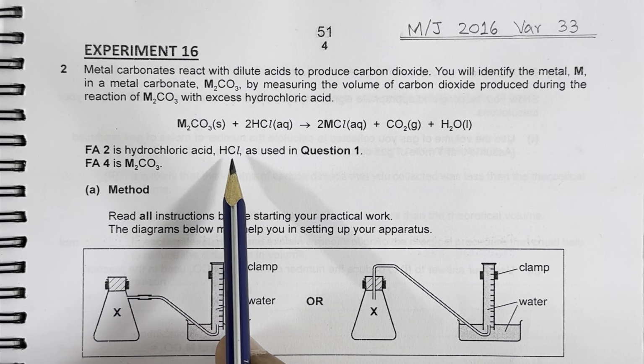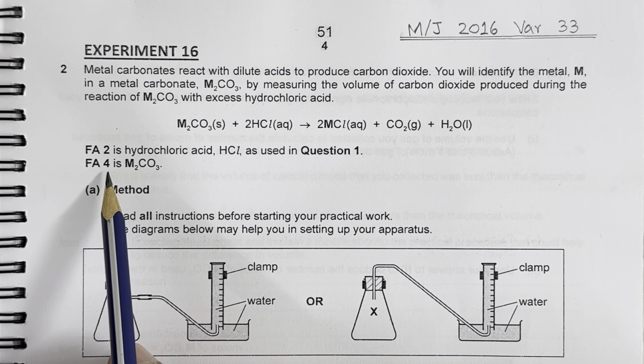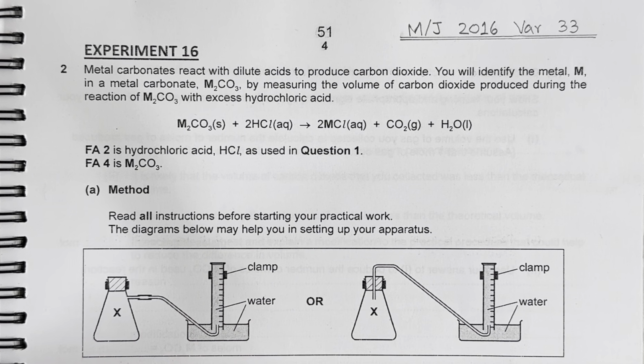Fa2 is hydrochloric acid, HCl, and Fa4 is metal carbonate.